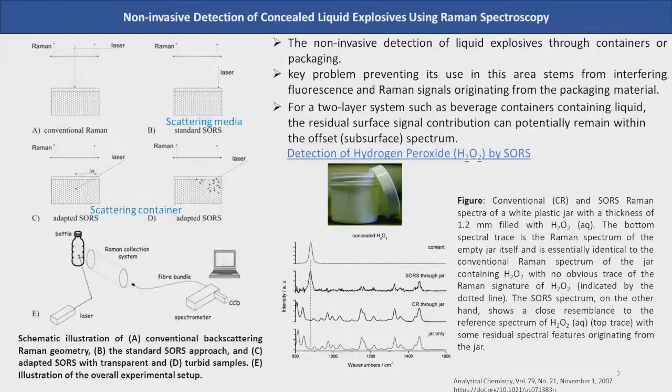So there is a word here, non-invasive detection. Non-invasive detection of concealed liquid explosive. It means you do not open the bag. So an explosive which is liquid is hidden in some packet, and without opening the bag, you can identify the liquid, whether it is of a particular nature or not.